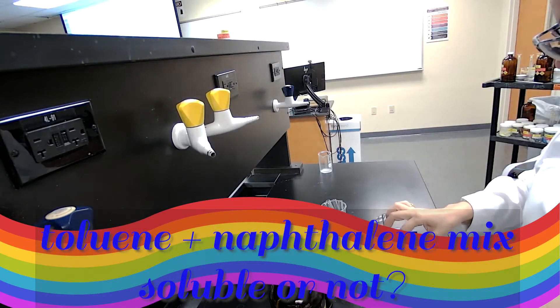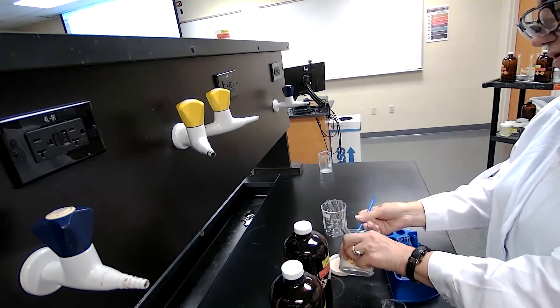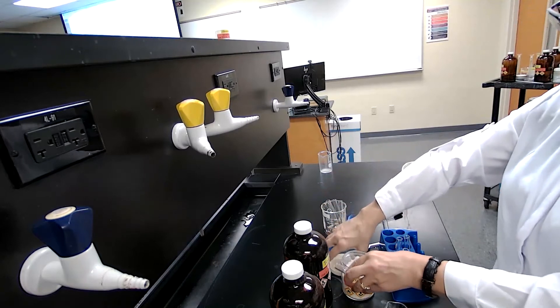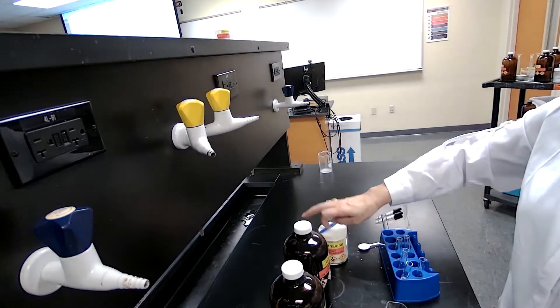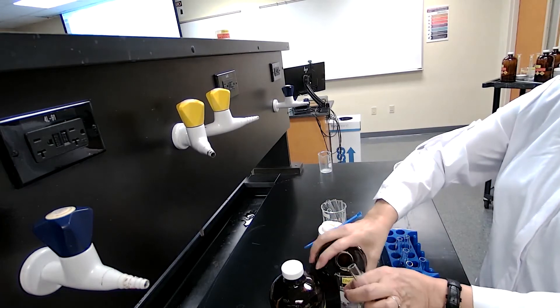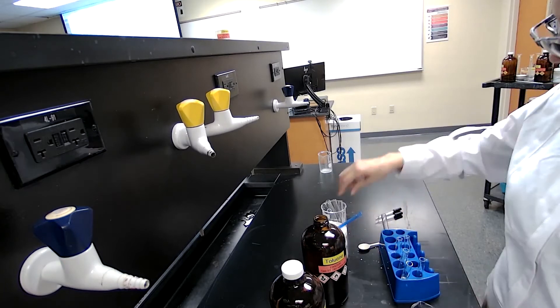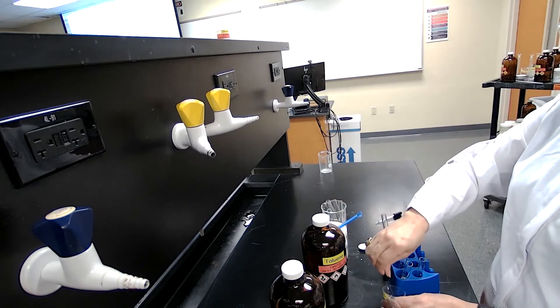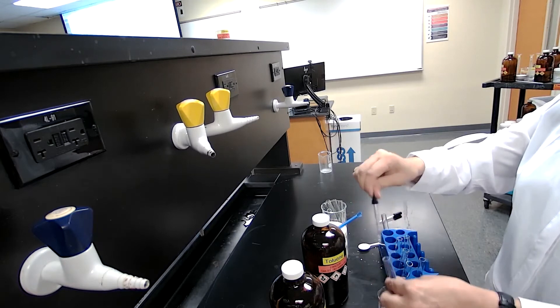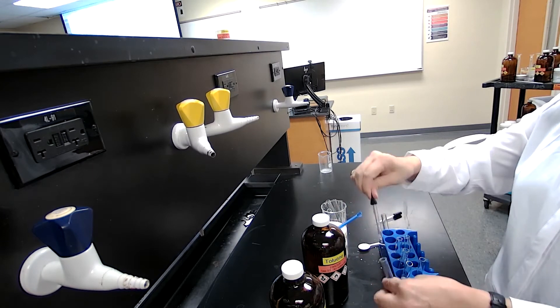For the next experiment we are going to examine naphthalene again, but this time we are changing the solvent. We are not using water; instead we are going to use toluene, which is an organic, non-polar solvent. That's the toluene — check the label. I would use about three milliliters of toluene added to the naphthalene and see if it's going to dissolve or not.